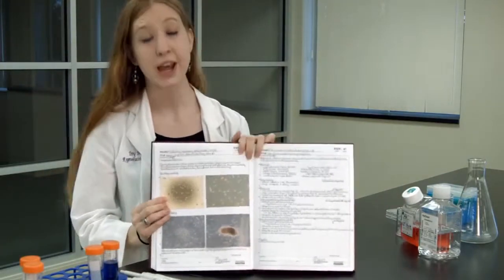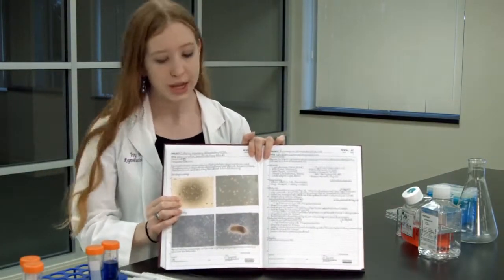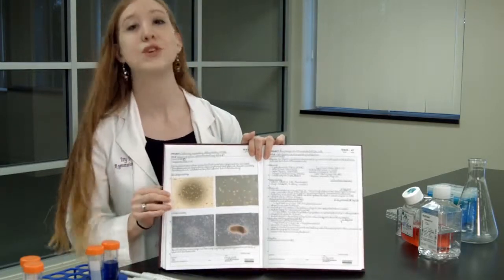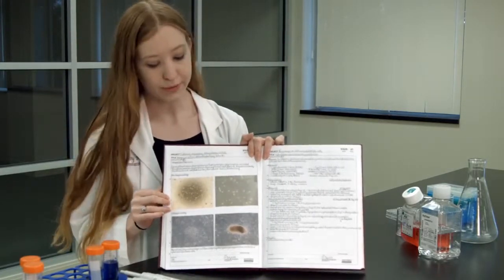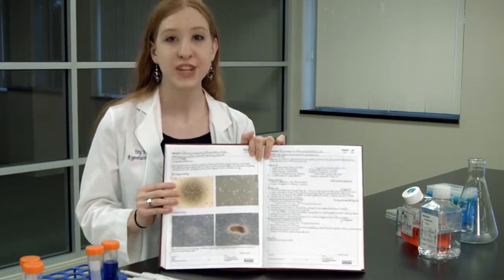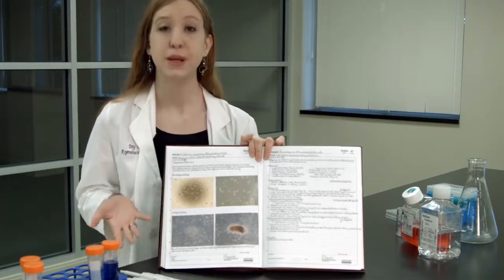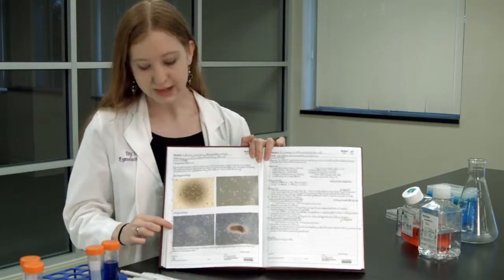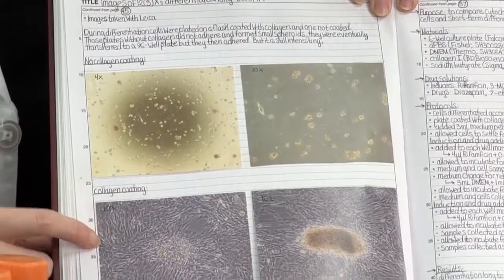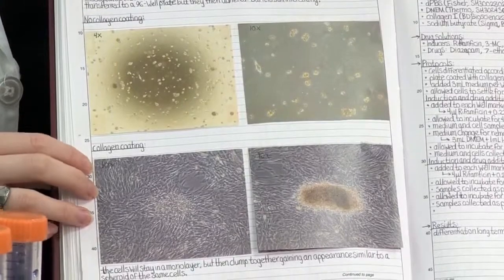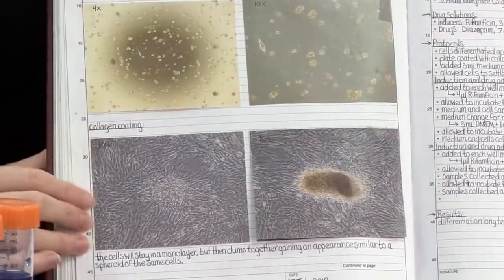It's also really helpful to have images of what you're doing or what you've done, especially if you're doing cell work. It can be really helpful if your cells change morphology or structure over time to be able to look back on that. For instance, on one day these cells were growing in a monolayer and they had a very spindle-shaped morphology.